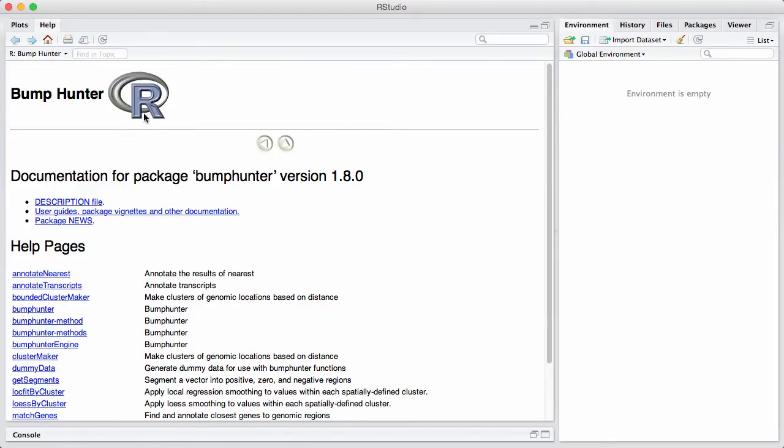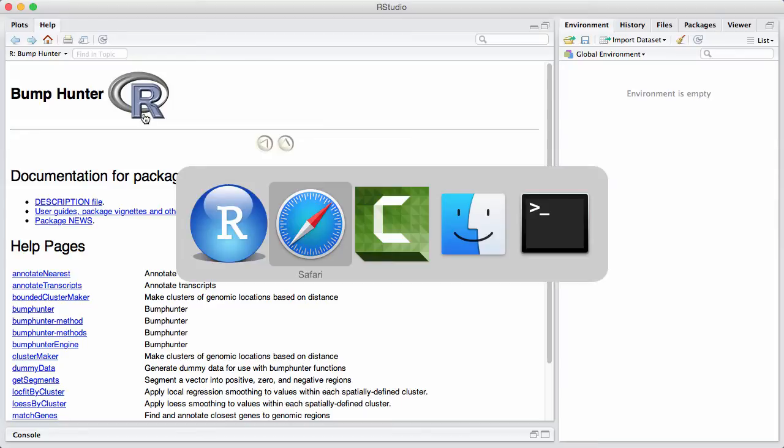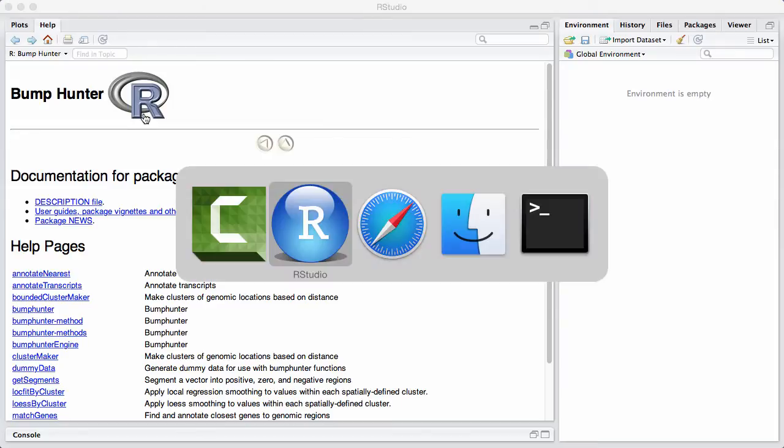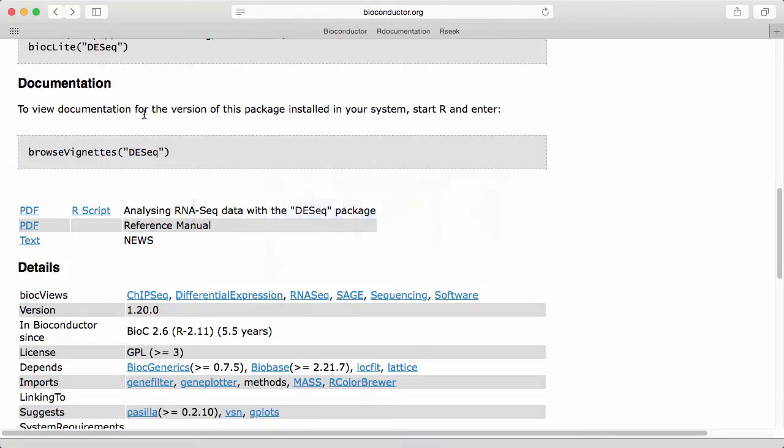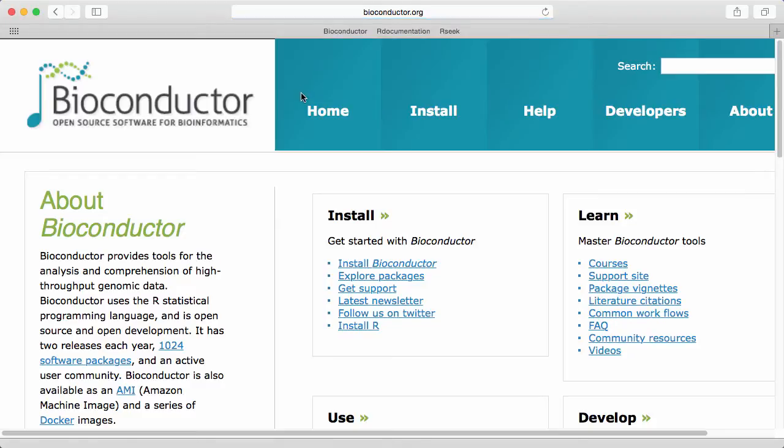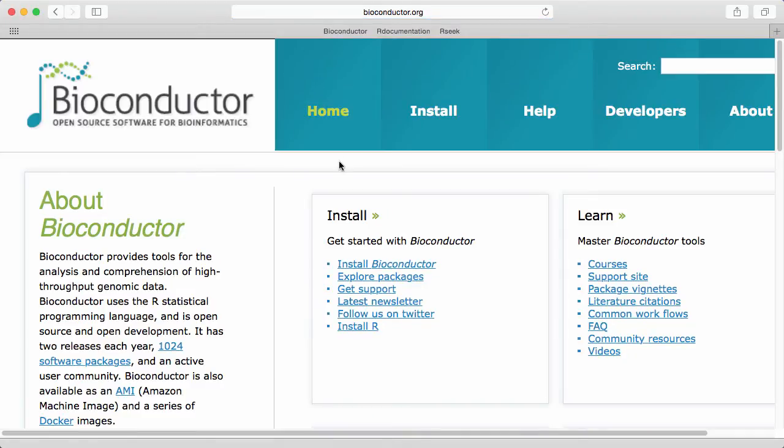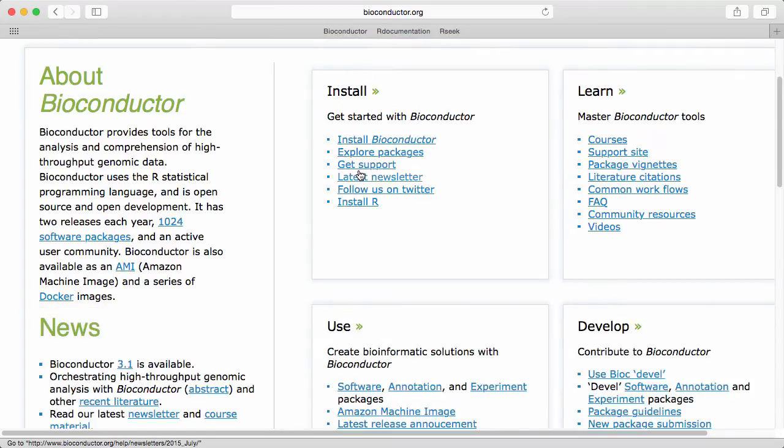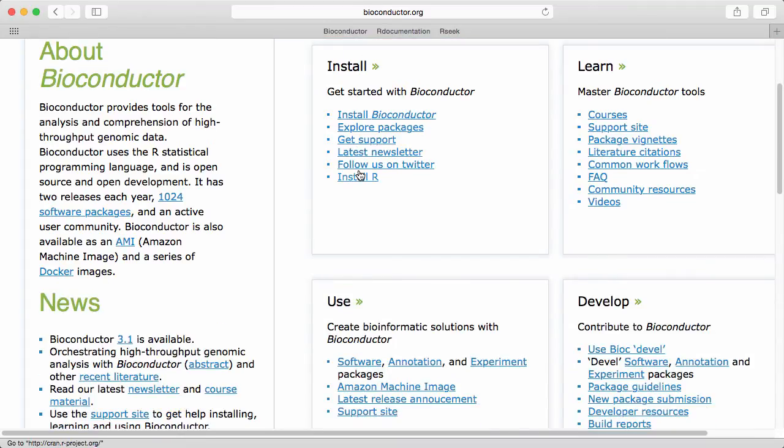Let's go back to the Bioconductor web page and let's get to the home of the page. So other useful information here is down under the learn site and I'm going to highlight this thing here called common workflows.